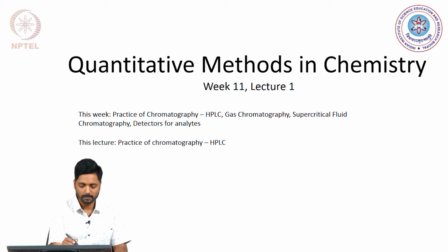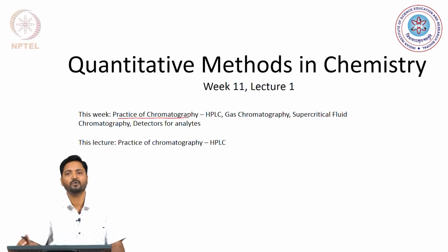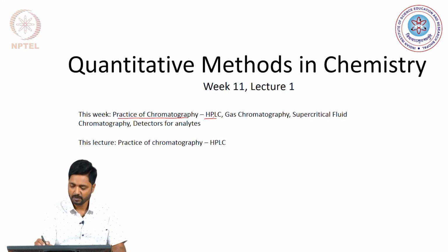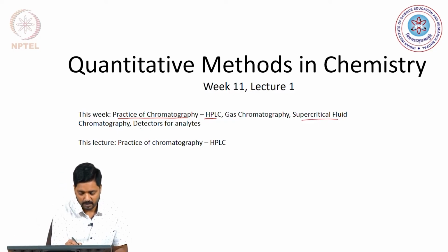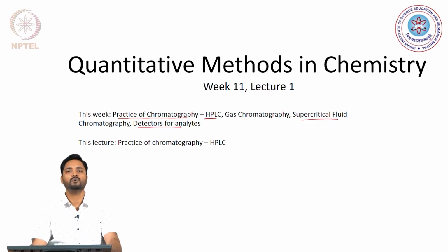We will be talking about the practice of chromatography in terms of how HPLC is performed, what is gas chromatography, the principles and the practice of it, and we will also get introduced to a very interesting form of chromatography which utilizes supercritical fluids as the mobile phase, and our understanding will also be developed in terms of what detectors are used to detect the analytes that are eluting out of these chromatographic columns.